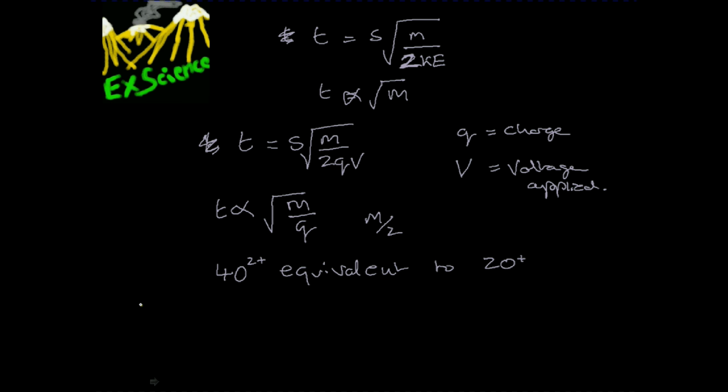Now, the electrospray is a continuous process. The sample plus solvent are pumped into the machine at a constant rate. In order to get accurate flight time measurements, particles must be induced to fly at the same time, separated along their flight path, and then detected, arriving at the detector. When the particles, which are positively charged, hit the detector, they are able to accept an electron from it, generating a current. This is measured, the magnitude of the current being proportional to the number of particles hitting.